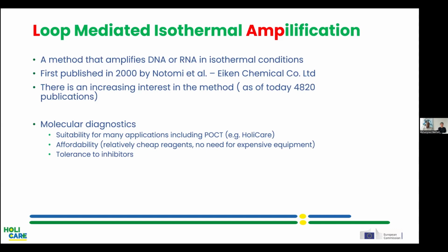Another very important characteristic is its tolerance to inhibitors, which actually helps in devising DNA preparation methods that are very simple. That's to say, not very pure, but enough to run the sample. And this is very important as time to results is also becoming very important. And I would like to mention that we are involving this also in the HoliCare project.